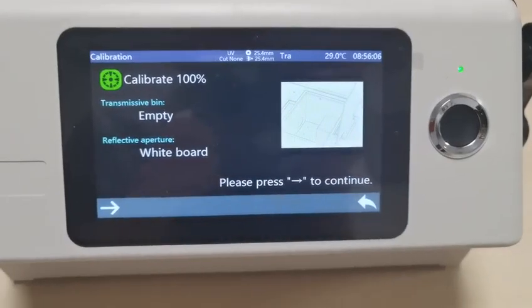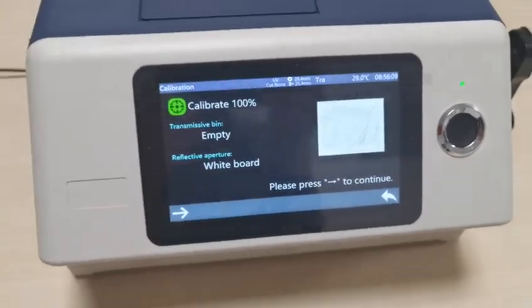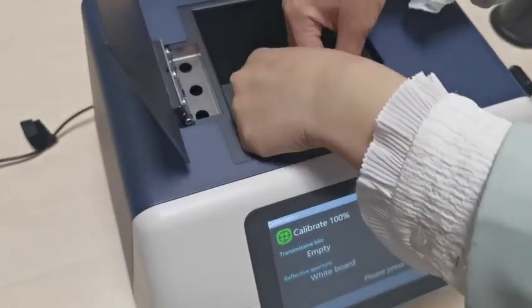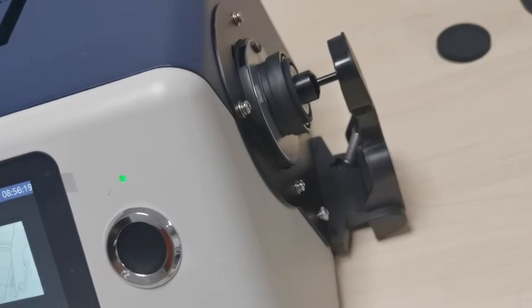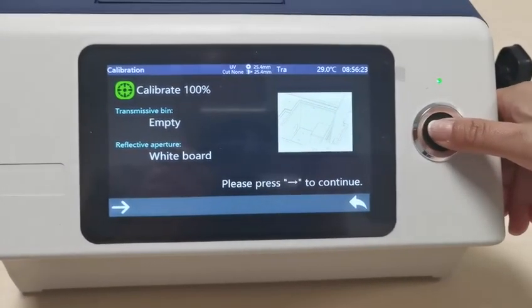Next is the white calibration. Empty the cavity, and keep the white board still on, and press the test button.